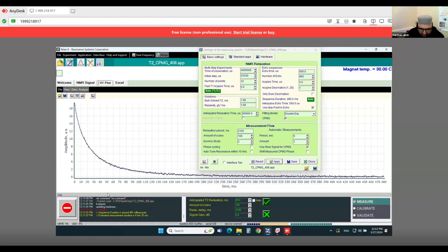So you see the results are getting better and better and the noise is reducing.